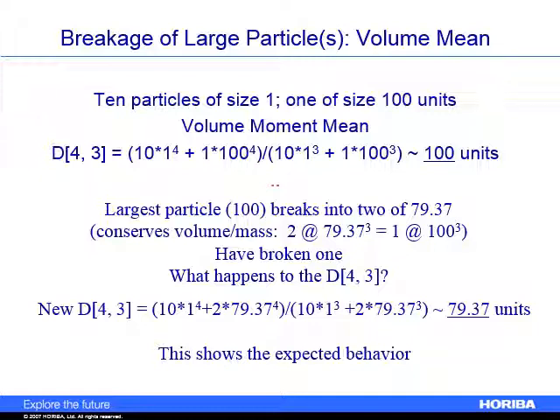This is actually what you would expect from the breakage of a particle when you look at it in terms of volume and not number, because you broke a large particle versus having a lot more of a small particle. On a number basis, that dominates the behavior. So mathematically what you see isn't really what you'd expect for the breakdown of a large particle.